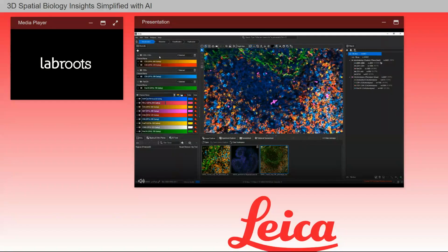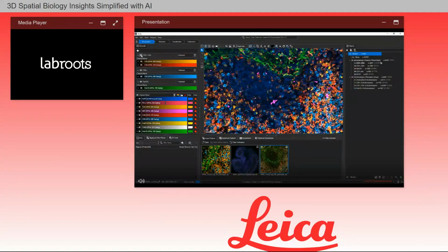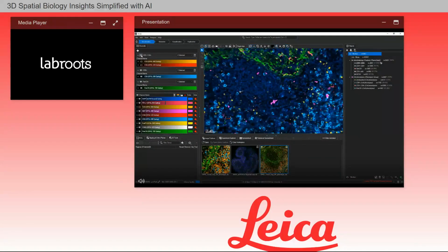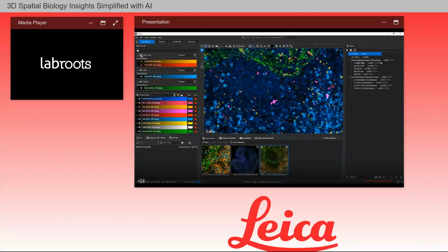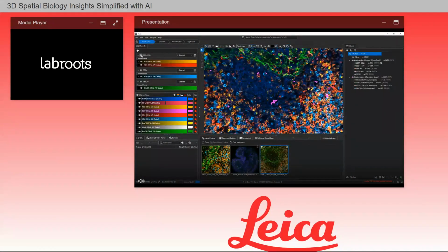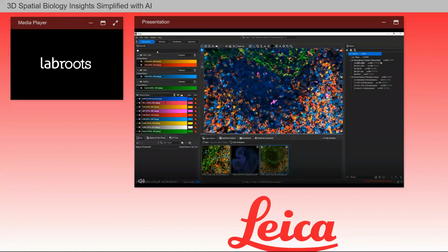On the left above the channel display, we have a new section for grouping biologically relevant channels. These are virtual channel groups for grouping related image channels that can be toggled on and off together, like I am showing you here for the CD3 and CD4 channels. These groups provide a shortcut to changing the rendered display without needing to search for the individual channels in the channel list below.